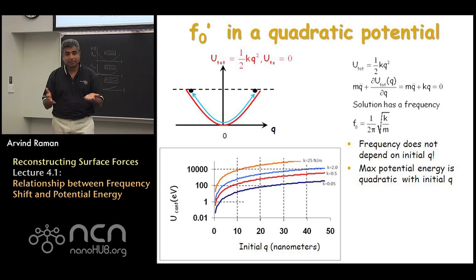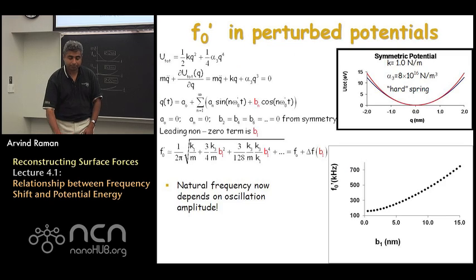And this forms the basis for the entire theory of frequency modulated AFM, which allows us to bring methods from perturbation theory to apply to frequency modulated AFM.